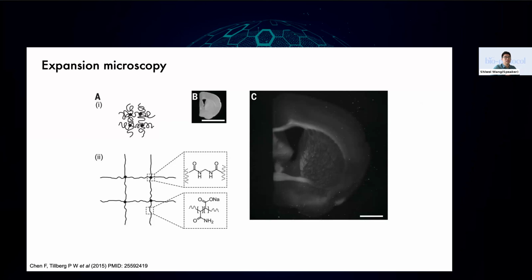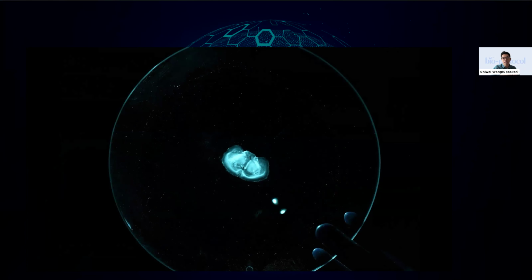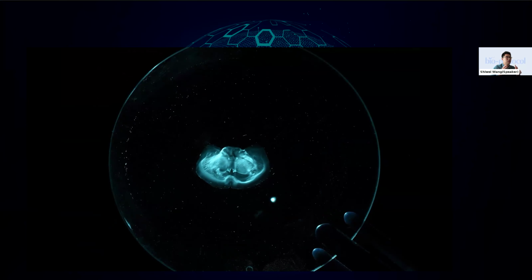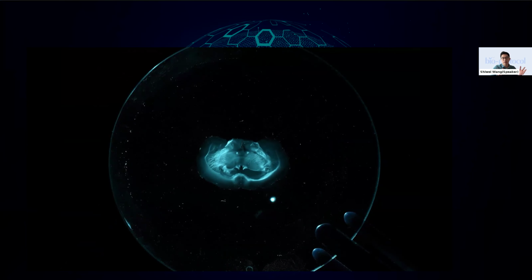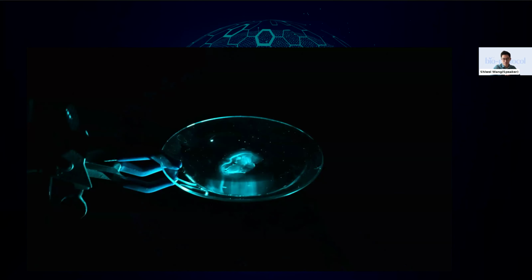We are very excited to see so many people in the world already using this technology to advance their science without the need of more advanced equipment or training. So here I have a video of how this technology works in action. Here is a mouse slice that's being processed by the original protein retention expansion microscopy protocol. You can see once the slice is softened and placed in water, the slice will physically expand isotropically, enabling super resolution imaging with conventional microscopes.